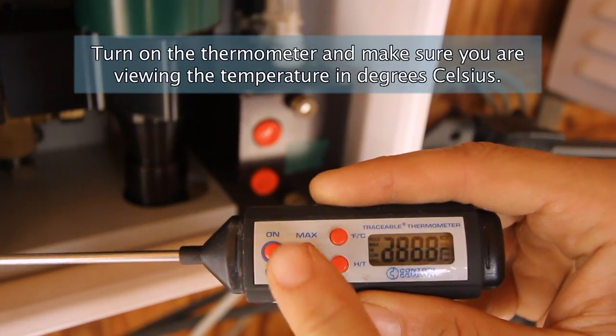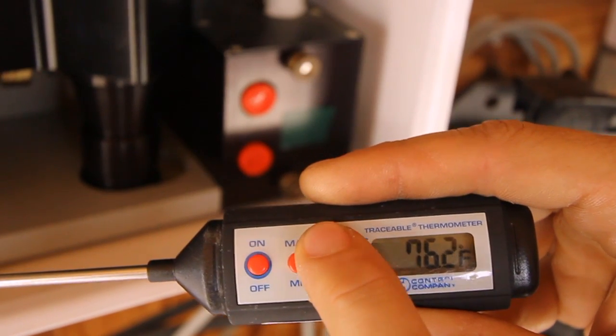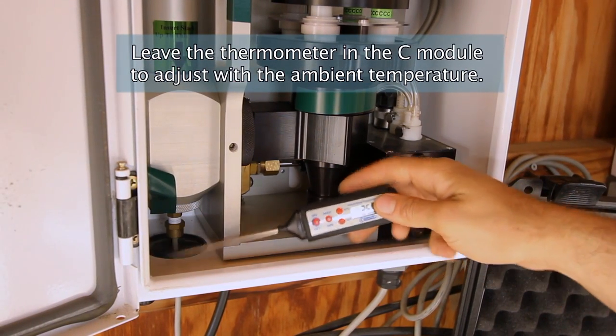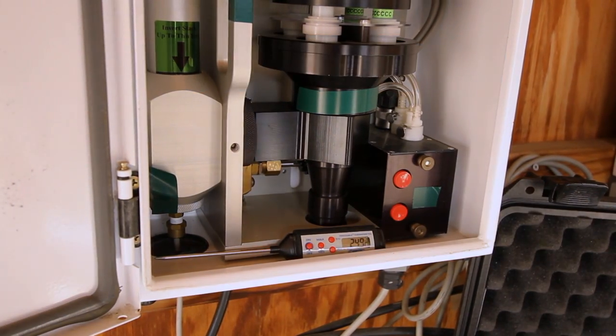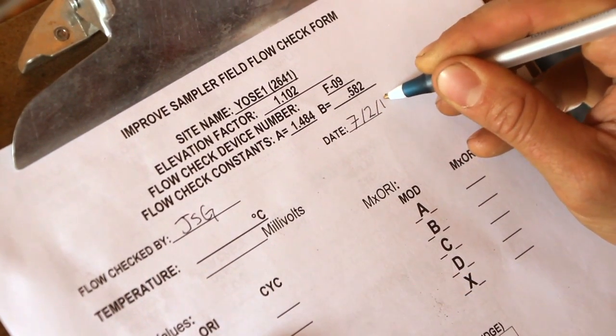Turn on the thermometer and make sure you are viewing the temperature in degrees Celsius. Leave the thermometer in the C module to adjust with the ambient temperature, and jot down your initials and today's date on the flow check sheet.